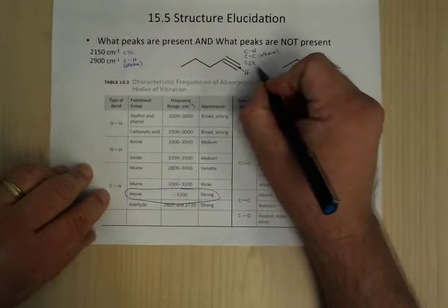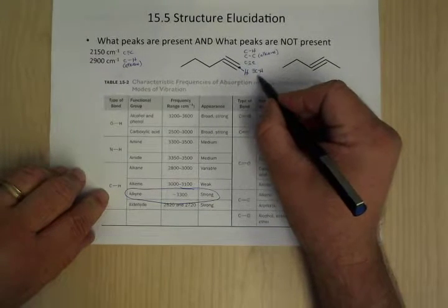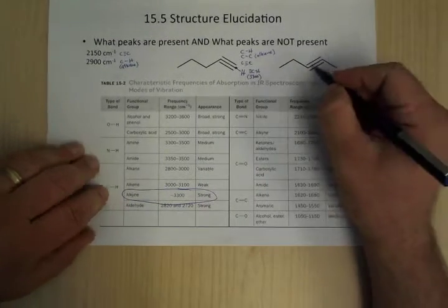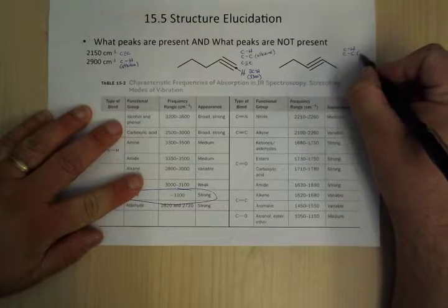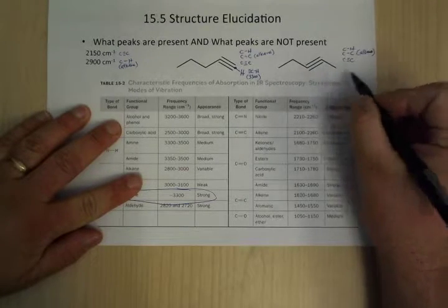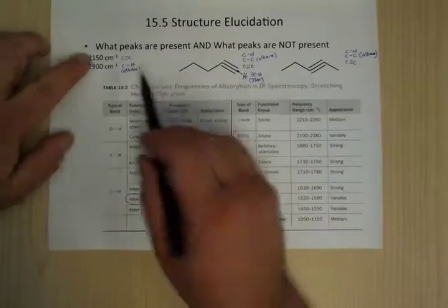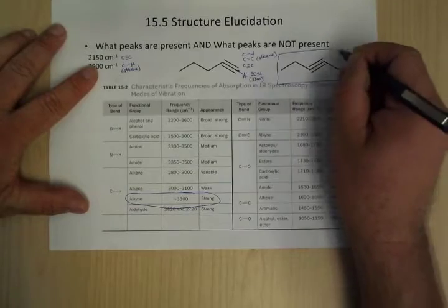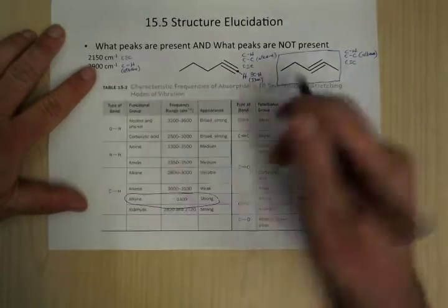So you would also have a CH peak coming off of an alkyne, okay? So this would be right around 3300, okay? Here you would still have those CH peaks and the CC carbon, the alkane peaks, okay? You would also have the alkyne peaks right here, but you wouldn't have this, okay? And so what that means is that this spectrum goes with this. Because in order for it to be this one, you would have to have this peak as well.